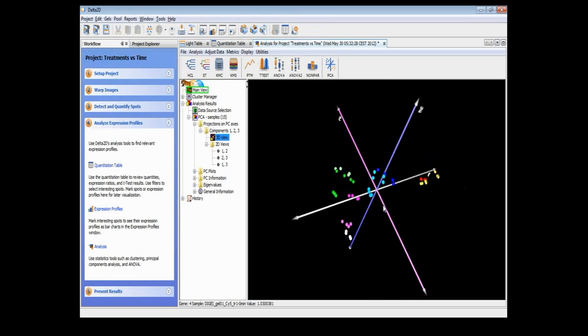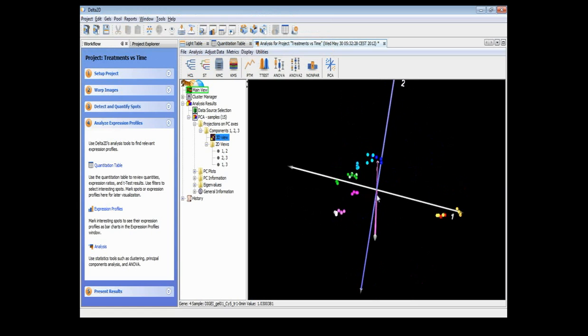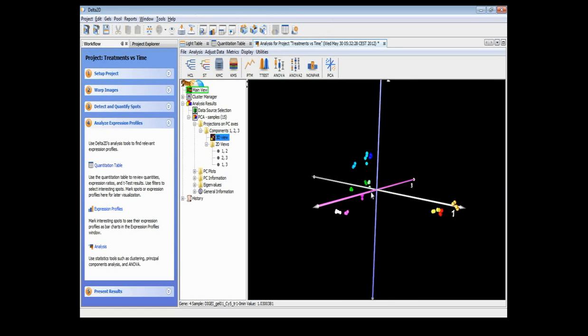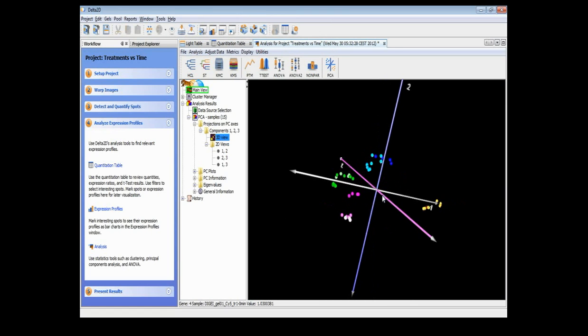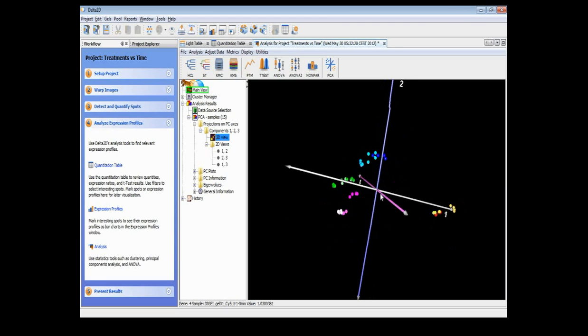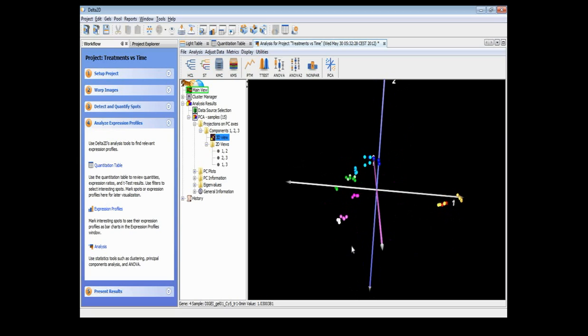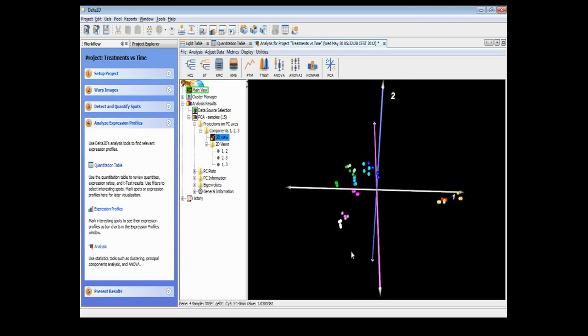And as we can see, there are shades of blue, shades of green and red, and it seems that within each color they are very close together, and also within shades of blue, for example, and also green. There are some differences here, some red, orange and yellow ones, but I think you will agree that these data points are clustered well.